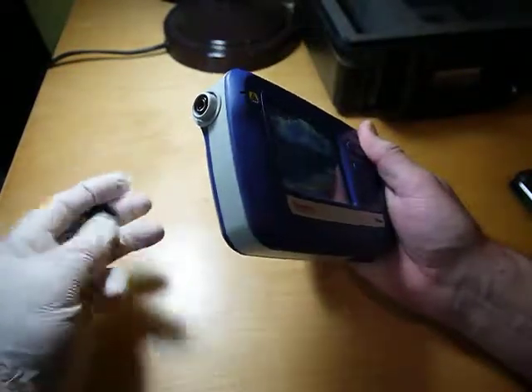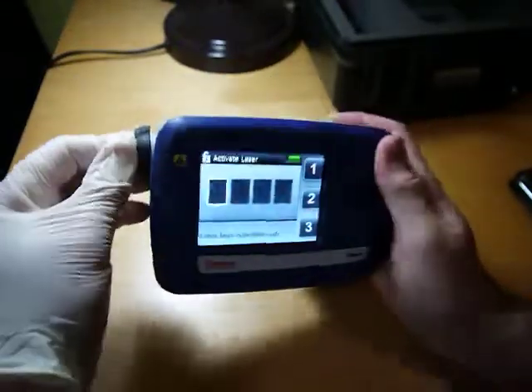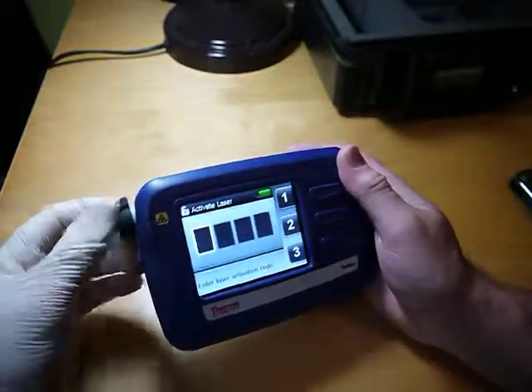There's a lens here. This is a protective cover. I just want to make sure this goes back in place — it kind of clips on. This is a daily check, a little piece of plastic that goes in place to make sure everything's working correctly.